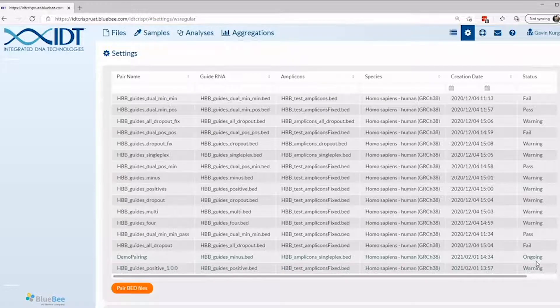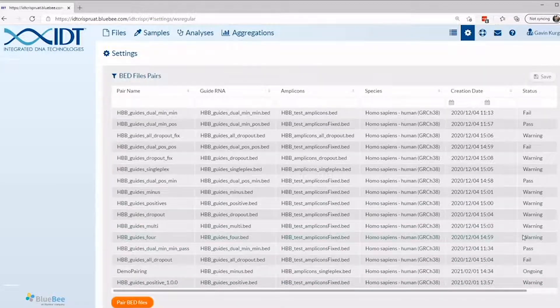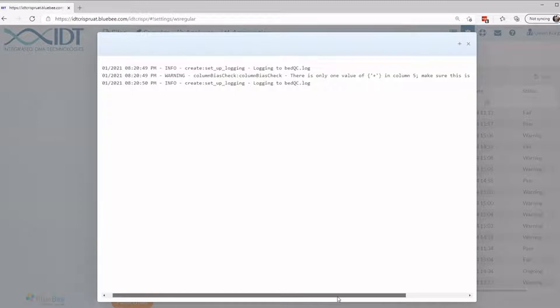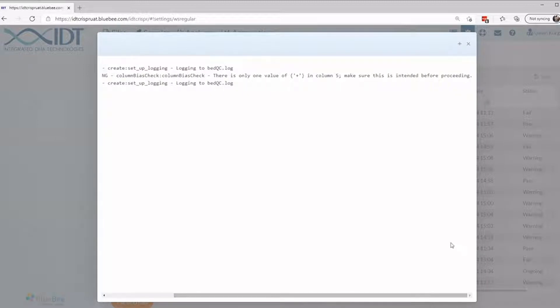A status message of pass, warning, or fail will appear when pairing is complete. If a pass status appears, you are ready to start your analysis. If a warning status appears, double click your pairing to see why the paired bed files were flagged. These bed files will still be available for analysis but should be reviewed to ensure there are no problems with your experimental inputs.